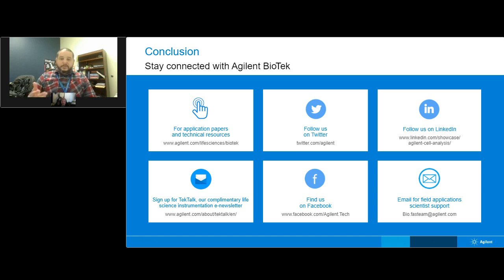So you can still image with them. There might be some configuration challenges as to which position you can use, but you can still image with other objectives, even alongside the water immersion objective.